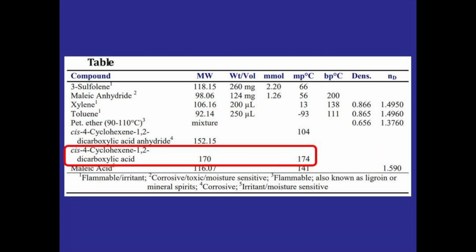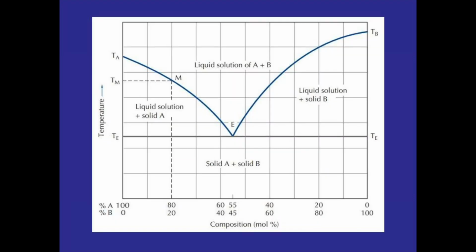So in the crystal structure that we're measuring, it contains the majority of the anhydride product, but has some acid contamination. And the question is, what's going to happen to its melting point if the contamination actually has a higher melting point than the product itself? To answer that, let's take a look at this diagram, which shows us two compounds and their respective melting points. So compound A melts at this arbitrary temperature, and compound B melts at a higher temperature than compound A.